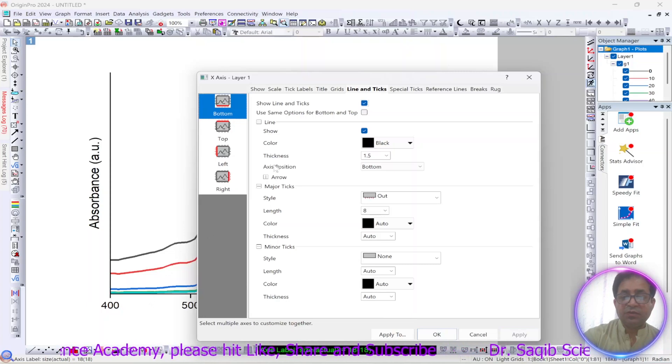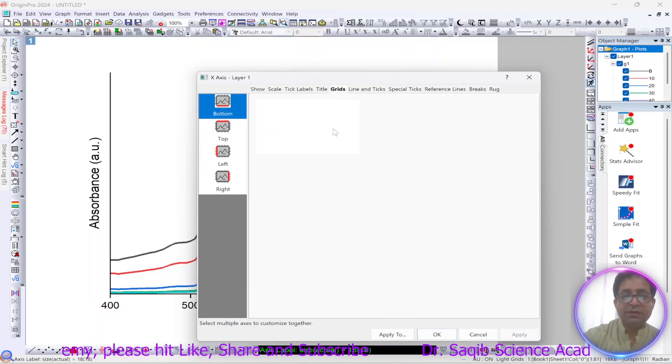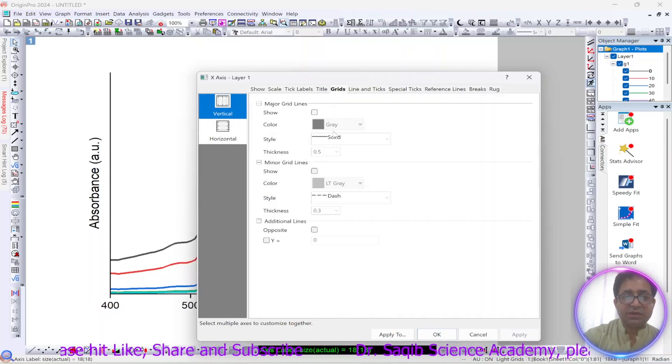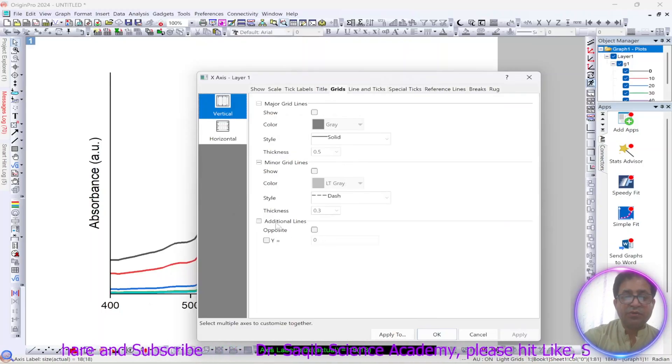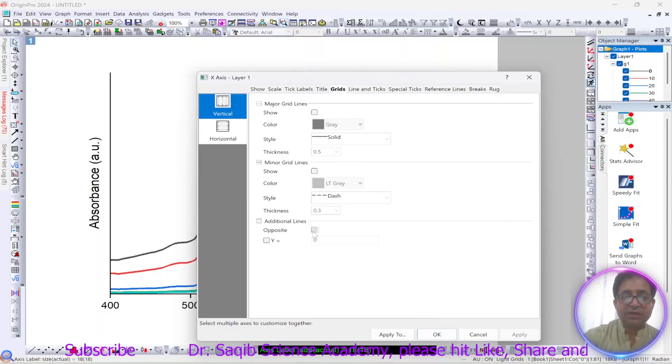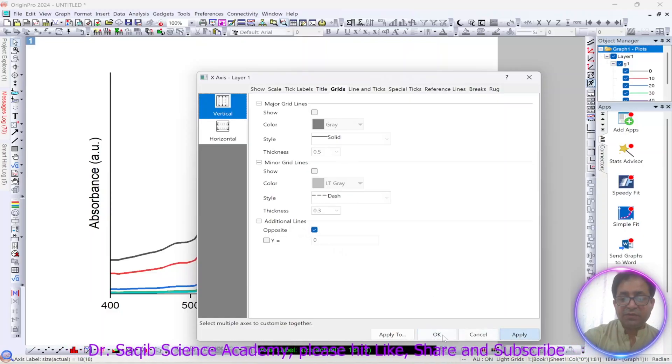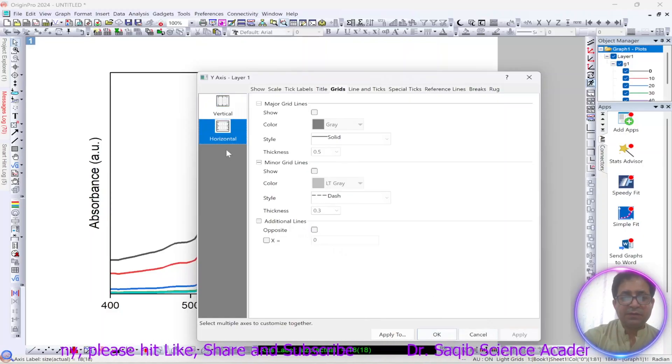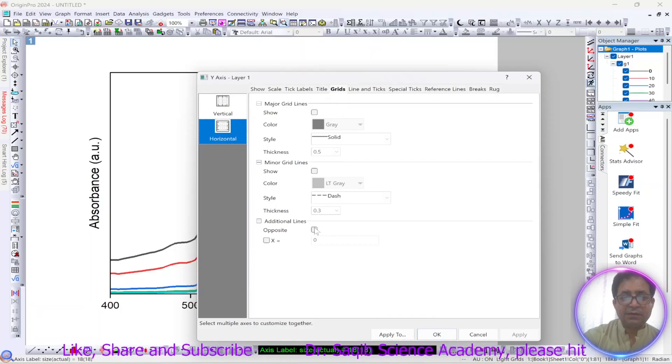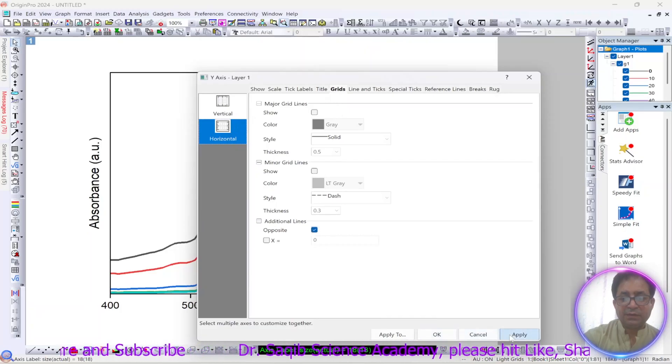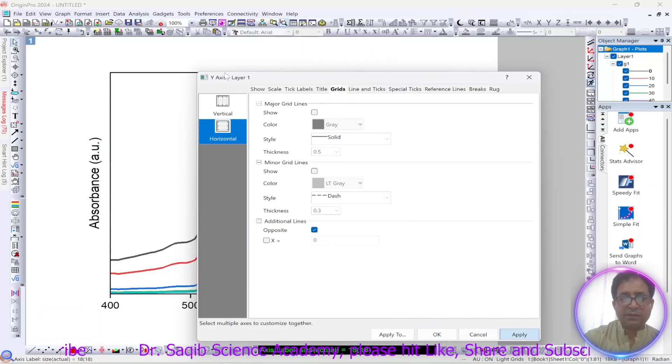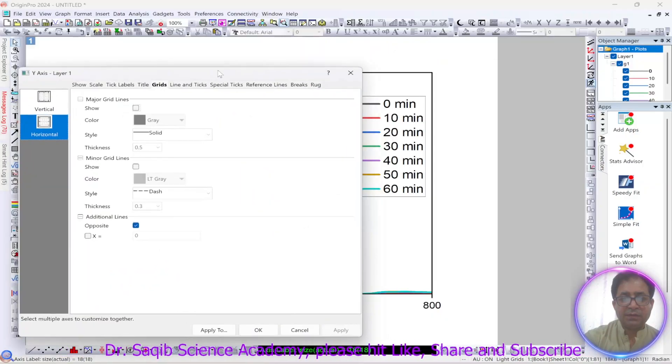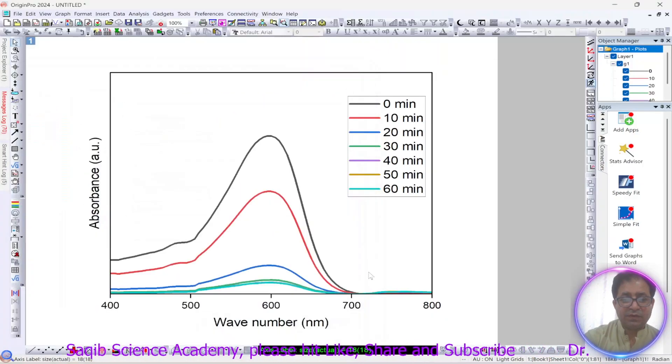Now we will go to the grid. As we want this graph to look better, so we will put the additional line opposite line and click apply and open.